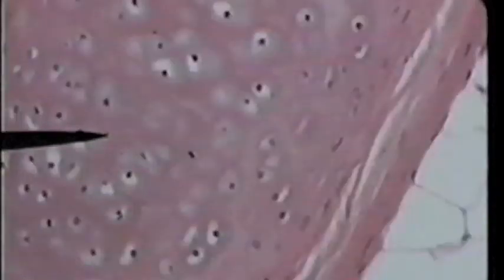The little white circle-y areas with the black dots are the lacunae with the cells sitting inside of them. We'll take a closer look in the next slide. In this view, the tip of the pointer is on the pink area in between the cells. This extracellular material is what we call the matrix. In this particular cartilage, the fibers are not visible in the matrix. That makes this hyaline cartilage.